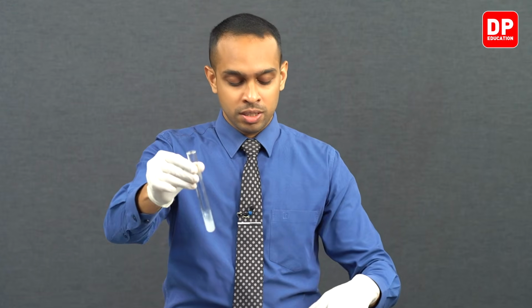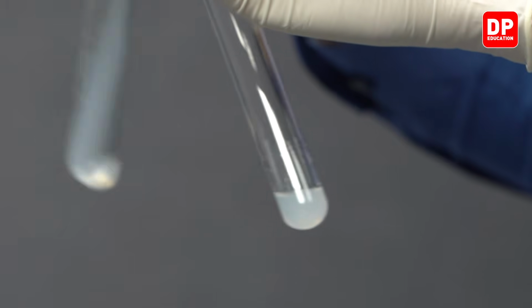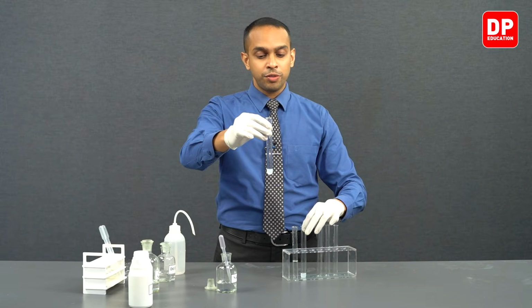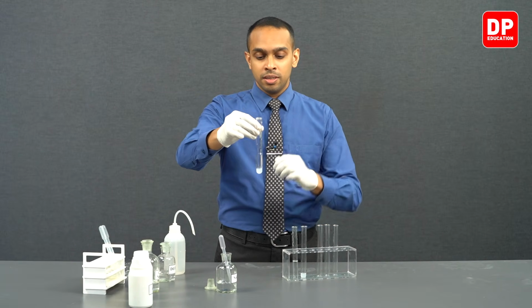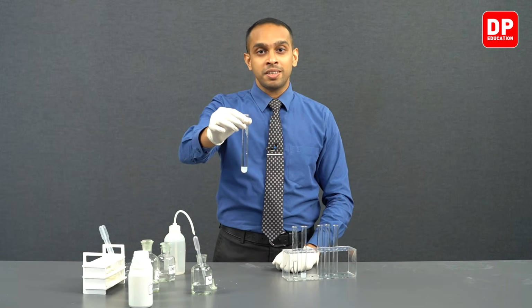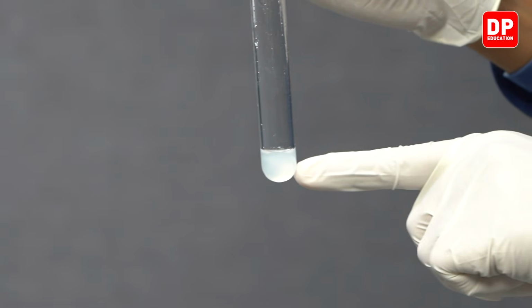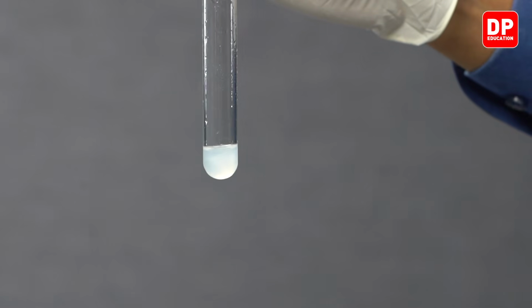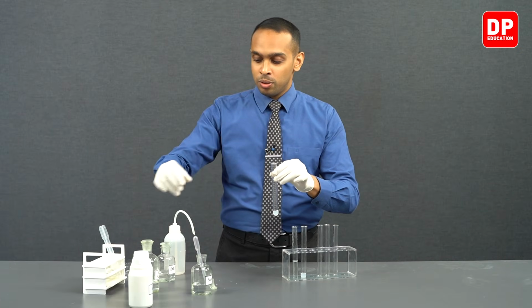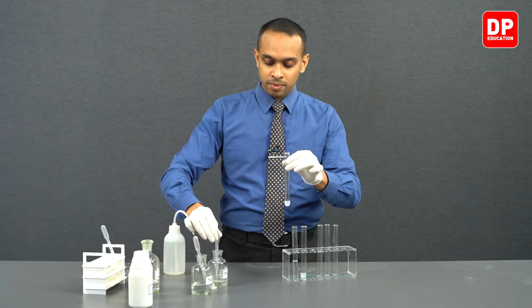Aluminium hydroxide is an amphoteric hydroxide, meaning if you take a small sample of this aluminium hydroxide suspension and react it with hydrochloric acid, it will dissolve in hydrochloric acid. And it will also react with excess sodium hydroxide and dissolve in excess sodium hydroxide as well. So this aluminium hydroxide white color precipitate that we have over here is an amphoteric hydroxide. So let's observe how it reacts with hydrochloric acid.